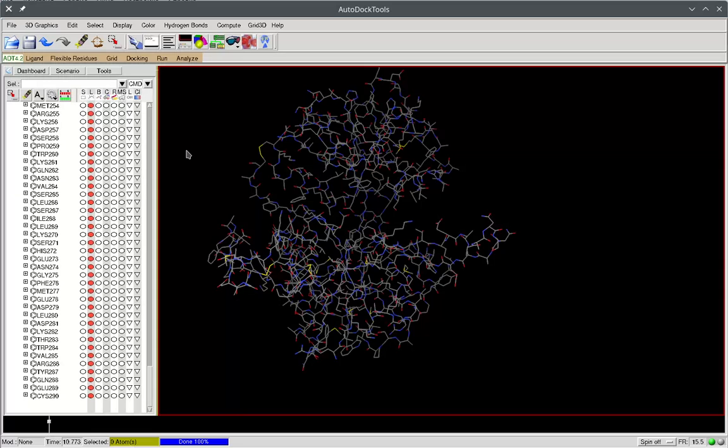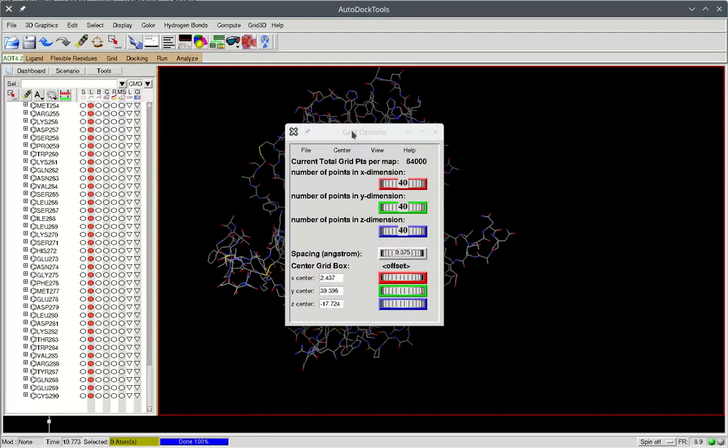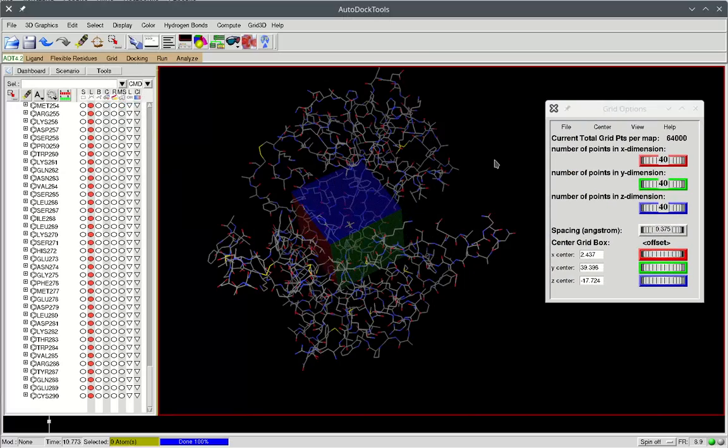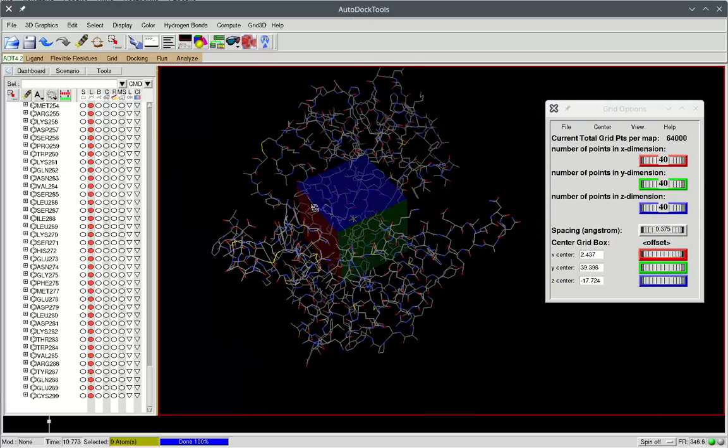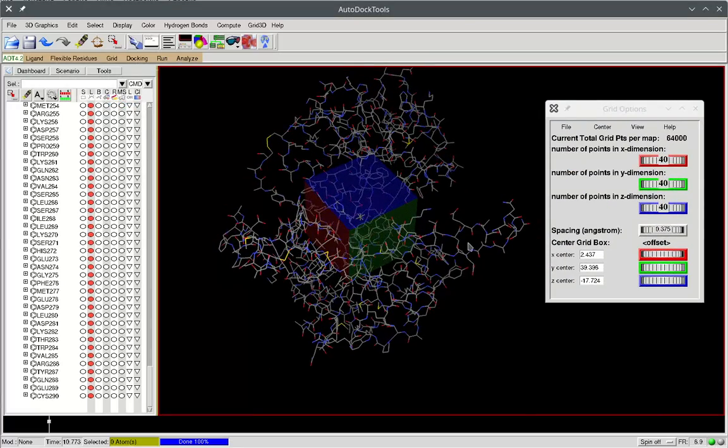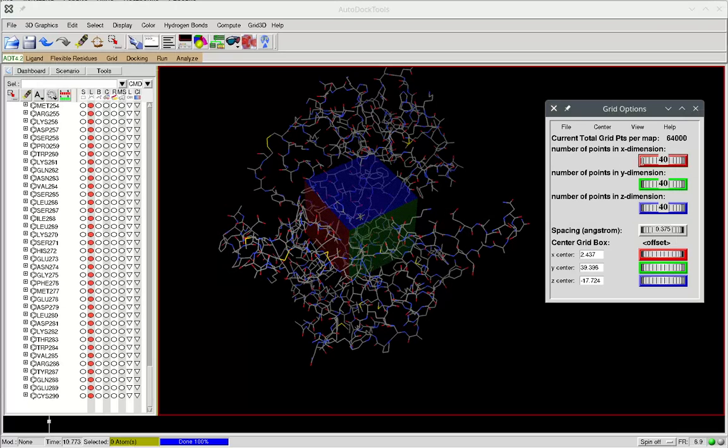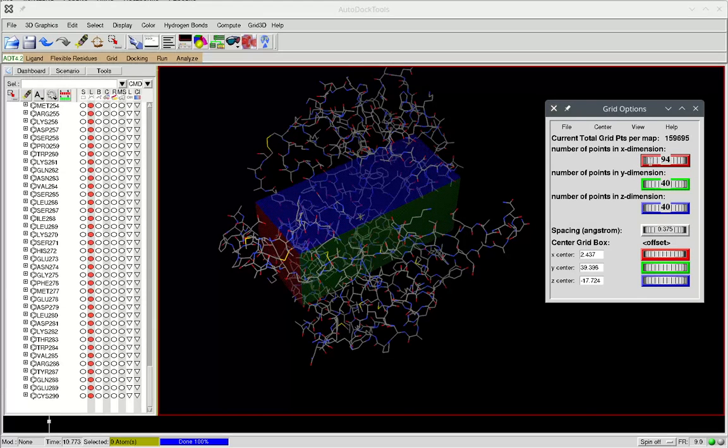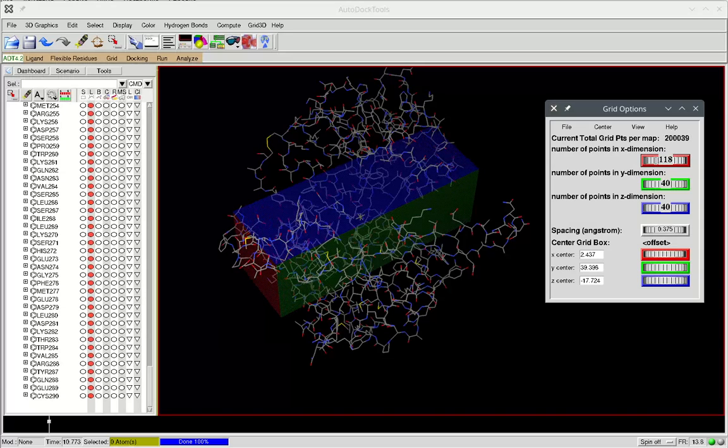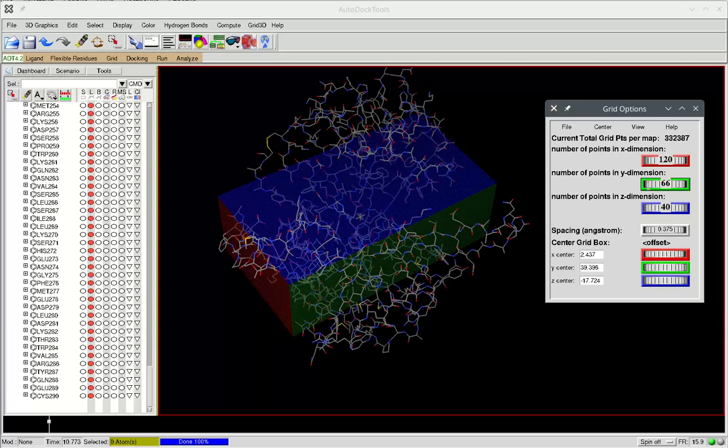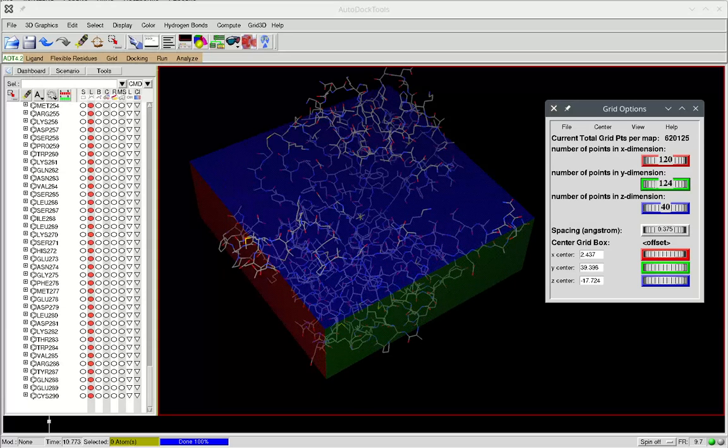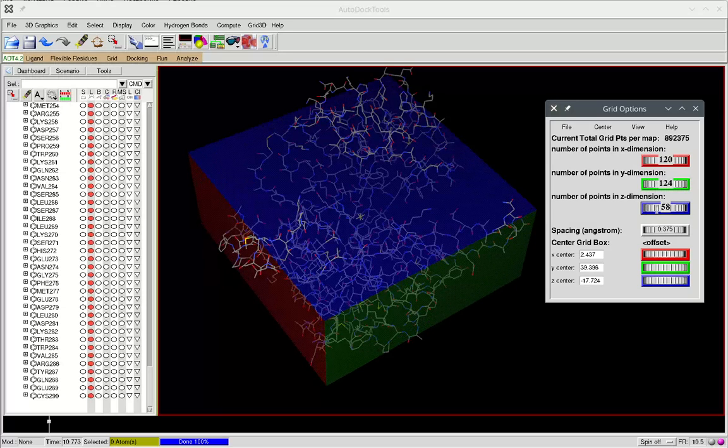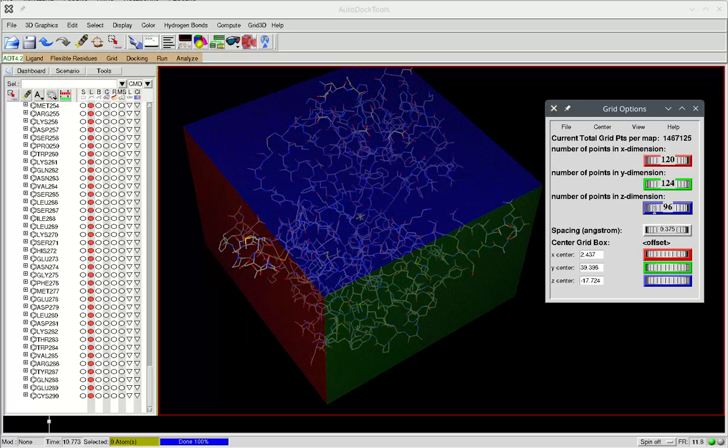Second, we need to specify the grid box. This is the region of the macromolecule where Auto-Dock will actually perform the docking. Usually the center is good enough and we just need to change the size of the binding pocket to allow larger molecules to dock and to cover most of the receptor.